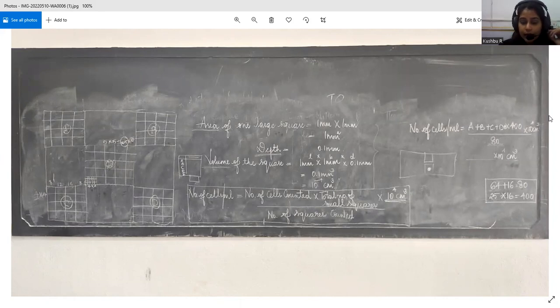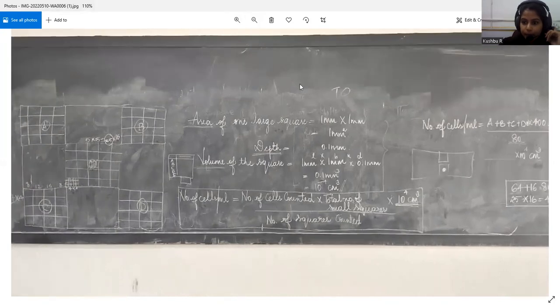The haemocytometer looks like a thick glass slide which has two steel linings, with particular grooves and partitions in them. When visualized under the microscope, this is the partition that we could see. In today's class, we will be learning more about the calculation for yeast cell enumeration. To enumerate yeast cells, what is the calculation that we can take up?